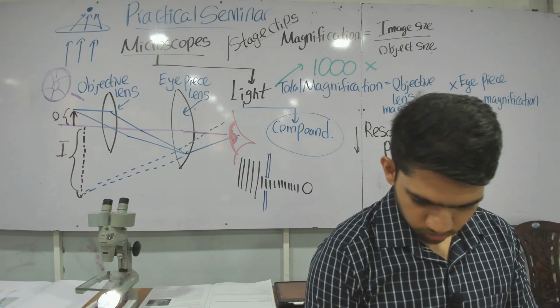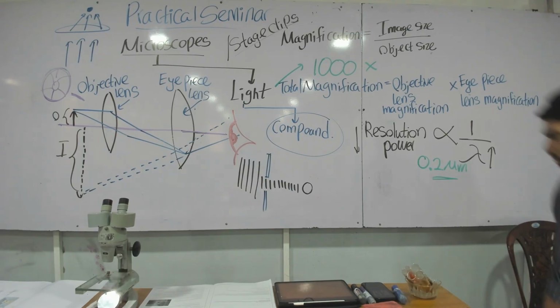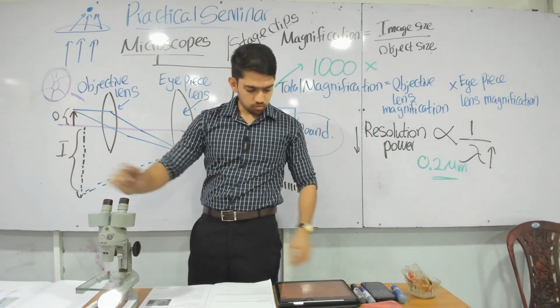Anything you missed? Anything else? Fine focus and coarse focus. Sorry, we have 2-3 minutes.